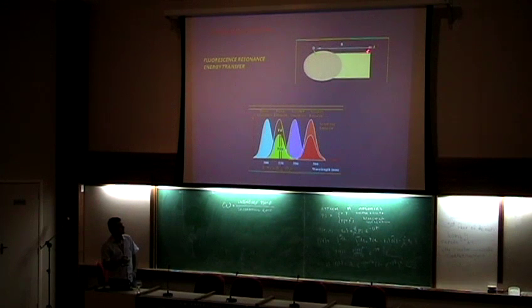you can do these measurements. So for example, a protein, if it's folding, of course, this distance is going to decrease, and then you can follow that as a function of time at very diluted conditions. So using a laser, you can have a very good yield of the emission. The energy transfer will occur if there is an overlap between the emission spectrum of the donor and the absorption spectrum of the acceptor, and then you have the sensitized emission.